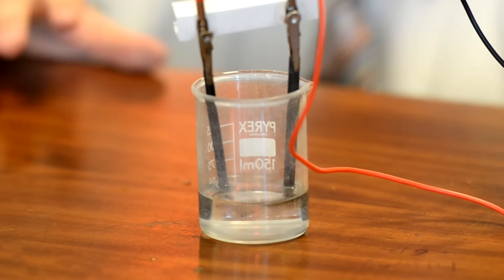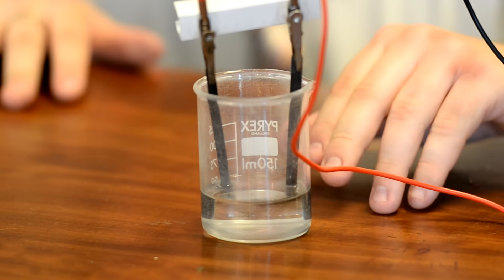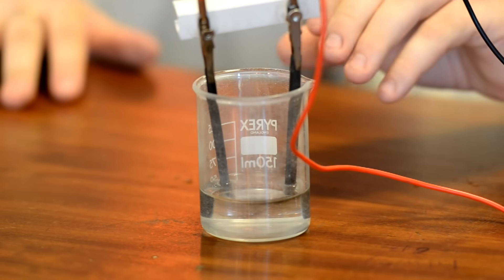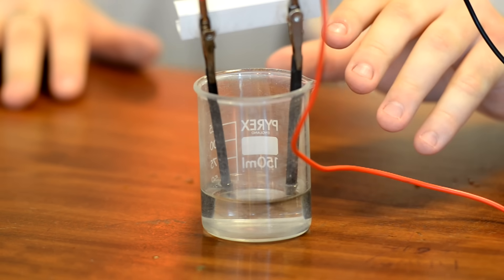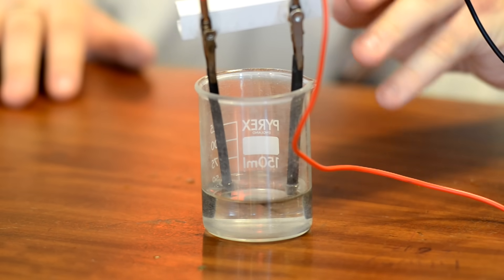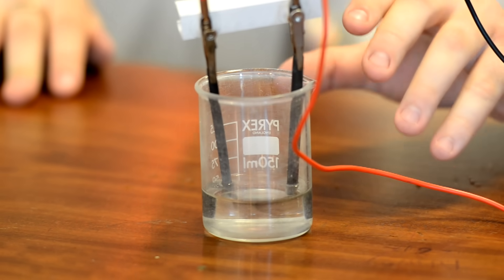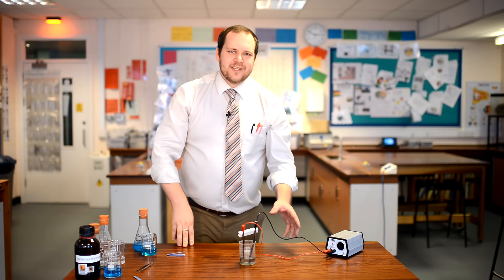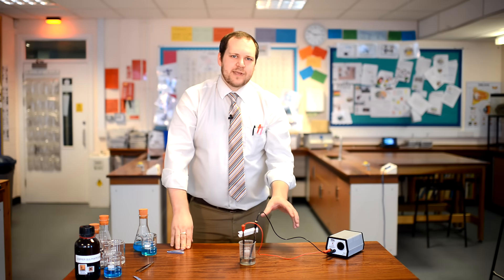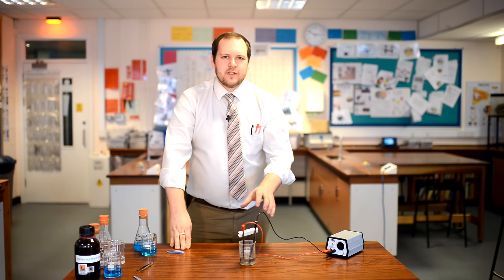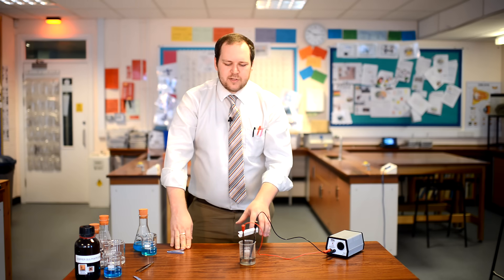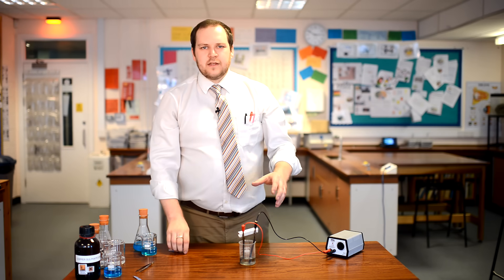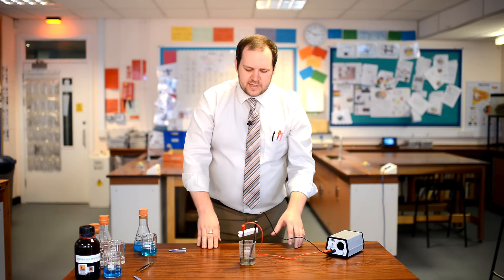Now this time we have got bubbles forming at both electrodes. At the negative electrode, we have got hydrogen forming. Now the hydrogen formed in this experiment won't be enough to actually test it via our usual pop test. However, this time we have got oxygen formed. Where something is less reactive than the chlorine or the halide ions, we get oxygen formed instead of the sulphate ions which will stay in solution. They will react and bond with the sodium ions and stay in solution.